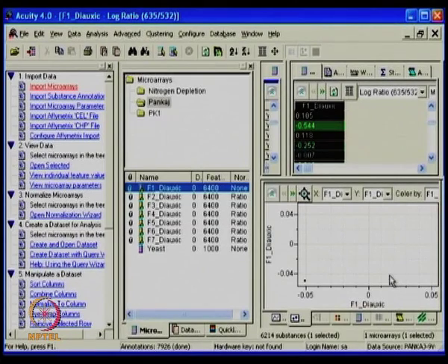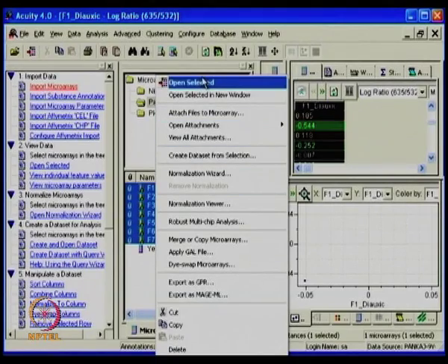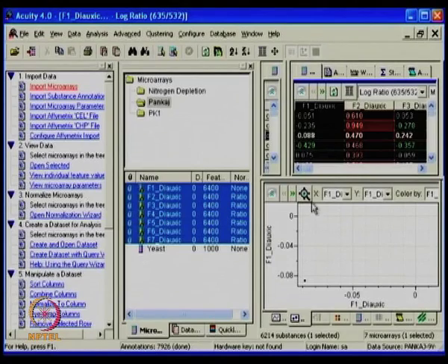Can we now select a couple of arrays and just align? The way to select here is to hold the shift button, and if you want to select only one more, or if you select all to the last, all can get selected. Then right click and click on open selected. What it does is it allows you to open all the images here. So it gives you whatever calculated ones you want to display, and if you click on that, each profile can now be seen here with the refresh button. If you keep going, you will be able to see all.